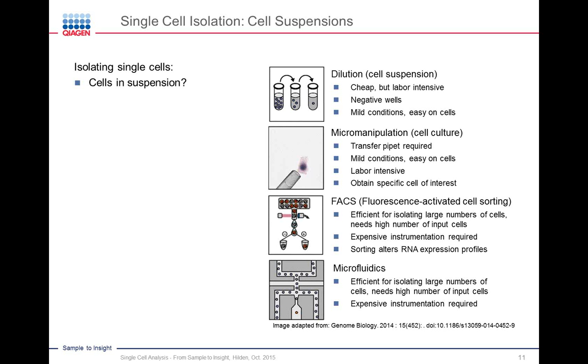It has the benefit for transcriptomic work that when you're diluting these cells, it's really easy. You're not necessarily changing the transcriptome too much. There are other methods that are much harder on the transcriptome of the cell, but this one is fairly good that way.